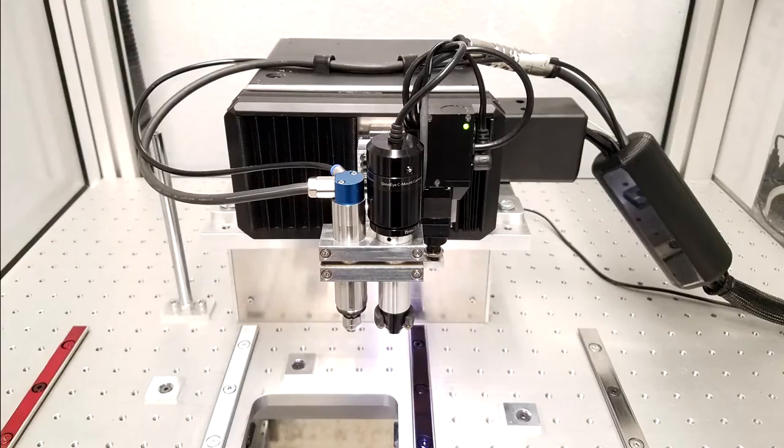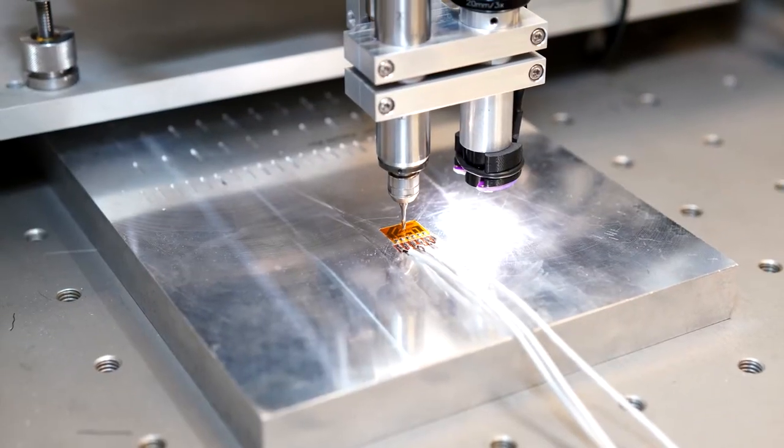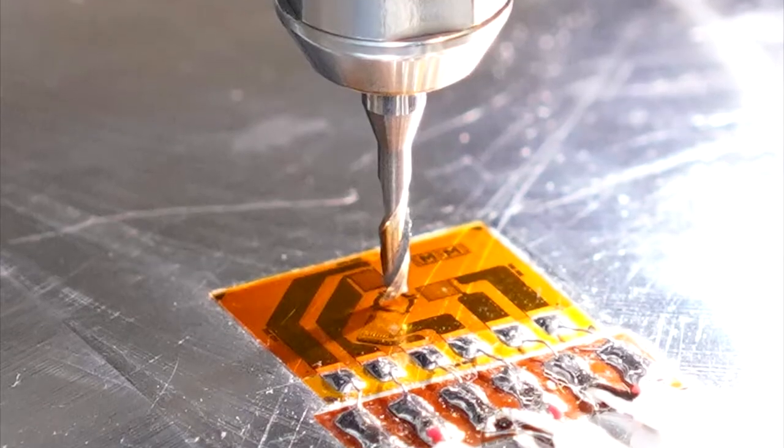Featuring advanced cutting strategies and real-time quality checks, the DART gives you confidence in your residual stress data. A turnkey DART includes everything required for your personnel to perform state-of-the-art residual stress measurements.